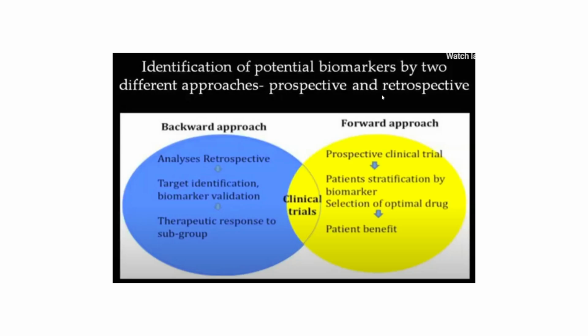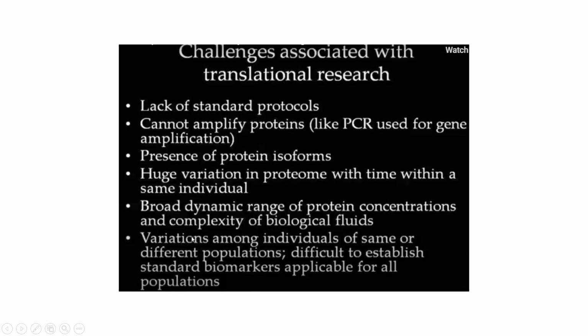Then this is the application. You can have it either as a backward approach or a forward approach. Forward is after the clinical trial. This is a backward approach, for initial identification, for biomarker identification, etc.